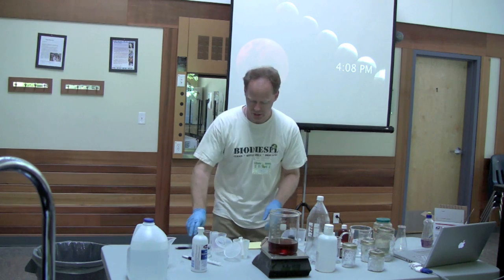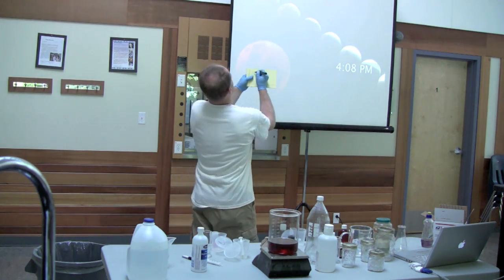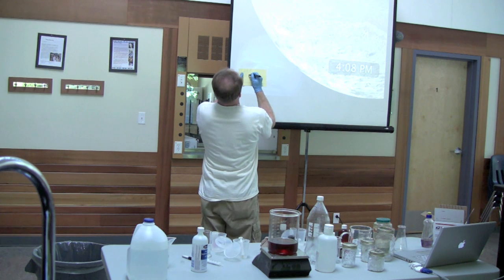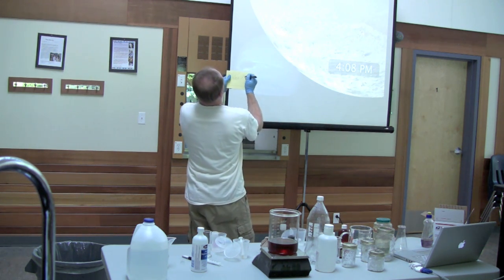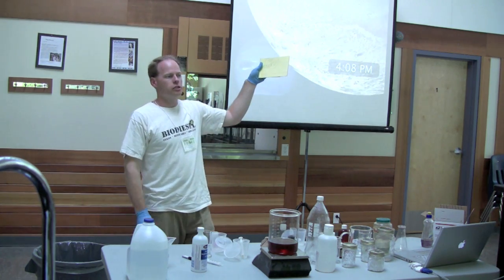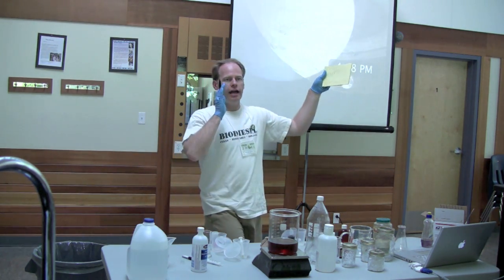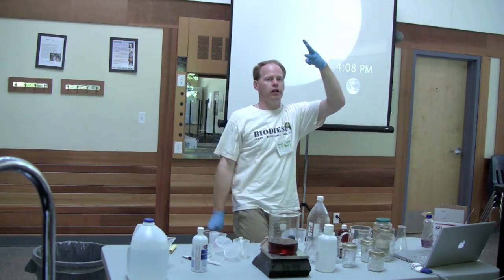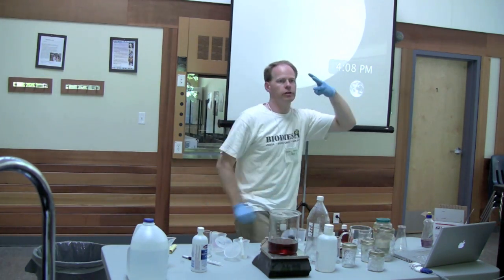Okay, so we've done 2 of these. We were getting to the math. 7 grams of KOH or 5.5 grams of NaOH is how much it takes per liter of oil to make biodiesel out of oil that has no free fatty acids, and if you're using absolutely pure chemicals.